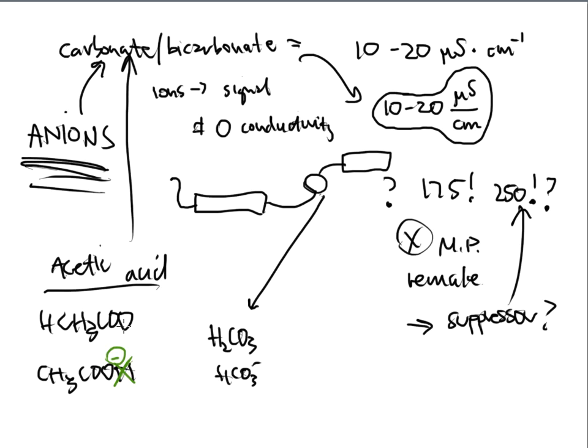It's just creating a little more ion for you in the mobile phase to help improve your resolution and to separate these things maybe a little bit better. The acetic acid disassociates. The pKa here for acetic acid, I think, is around 4.76. Now, I could be wrong. I'm not looking at a chart in front of me. But 4.76 pH is really where acetic acid begins to spit off the proton.